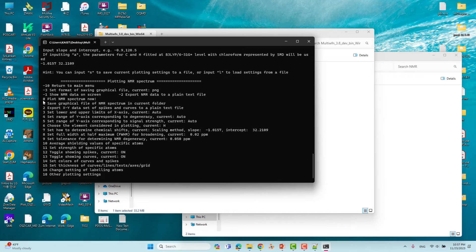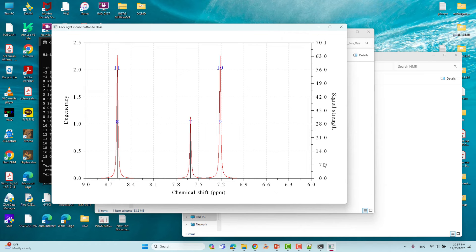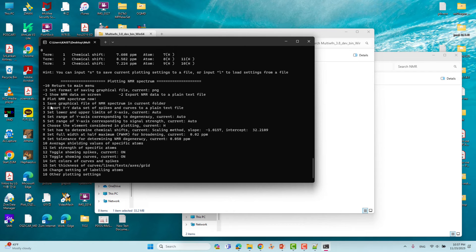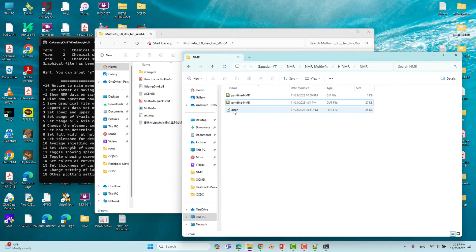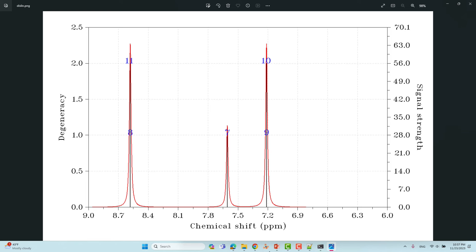Now we have reached the final step. Option zero means plot the NMR spectra on screen. Type 0 and press Enter — you will see the proton NMR spectra displayed. After closing the plot, you can save the graphical file. Type 1 and press Enter to save the NMR spectra image to your current folder. The image is now saved and you can verify it in the folder.